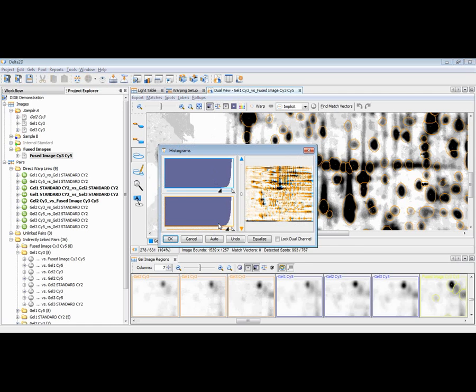Let me relax the histogram, the contrast setting again. I press now automatic contrast setting just to fix that. And this is a new feature which is being introduced with version 4.3. Every newly imported image is now automatically contrast improved when importing it. Of course, you can change the settings by moving these sliders manually at any point of time. It's only for visualization, as I mentioned. You can change that anytime. It's just for the first impression of the images.